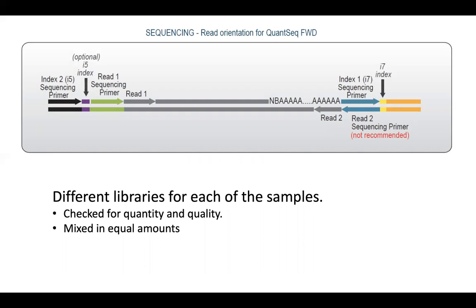And the number of samples can vary a lot. If you want to read in depth, you will have a limited number. And if you just want to read a lot of samples for a relatively low number of reads, then you can also mix lots of different samples.